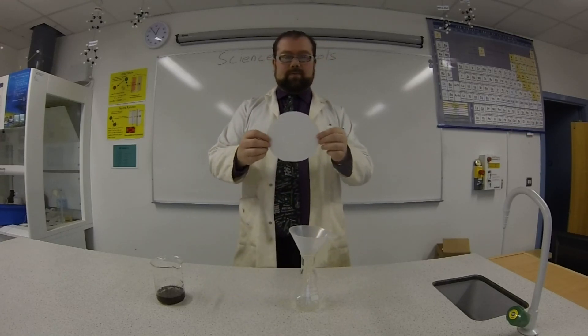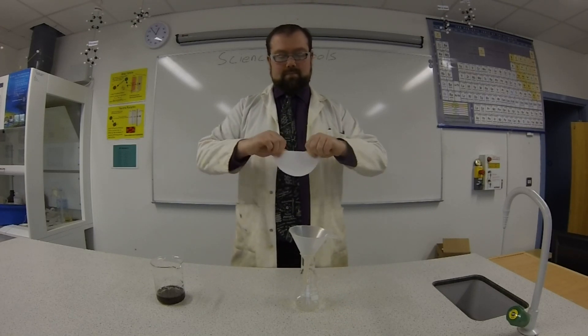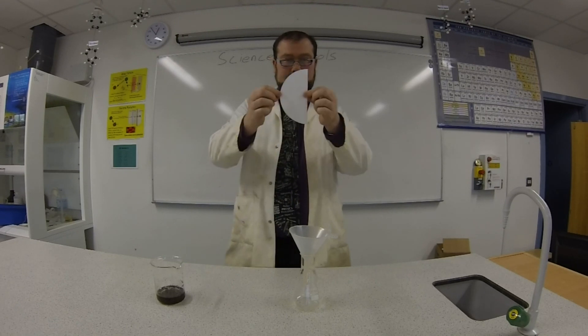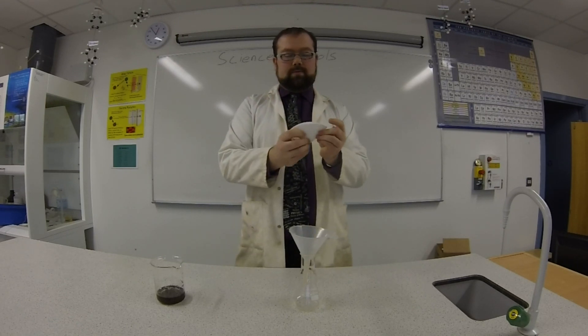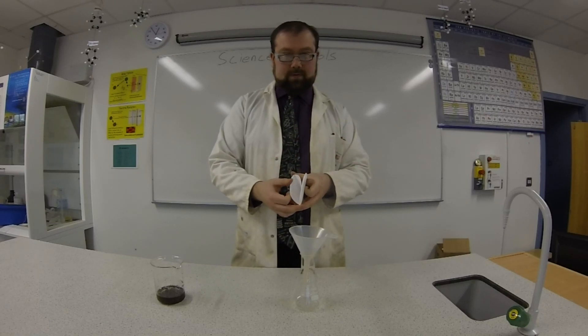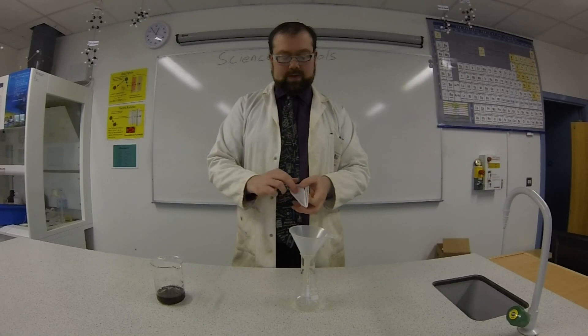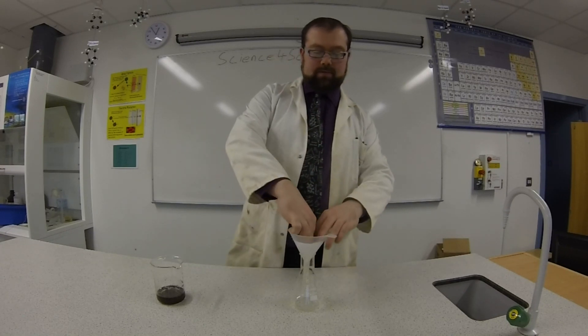First of all, we've got to take this filter paper and fold it in half, then fold it in half again so we have a semi-circle — a quarter circle. Now, we've got these four edges here. We're going to take one on one side and three on the other side, so that we have this cone of filter paper, and we'll pop that right into the funnel.